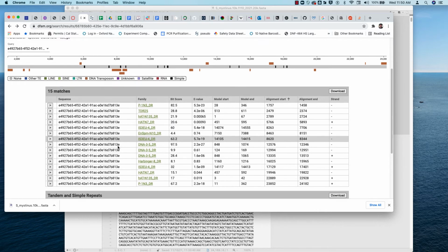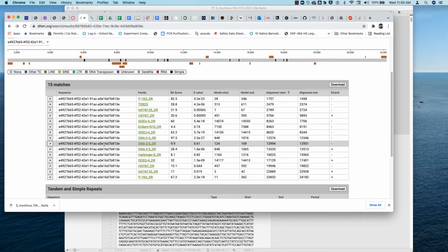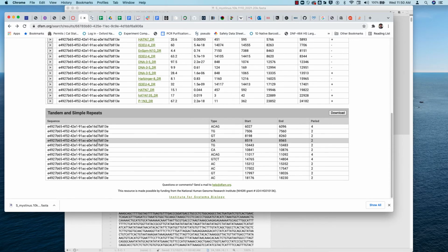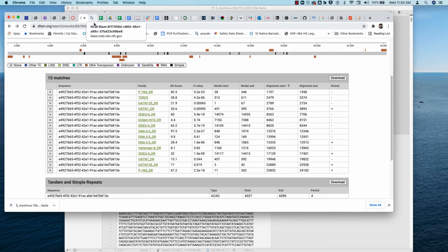So what you're going to do is take these results and the results from any blast results and put them onto a table that you'll be analyzing and using for your paper. You can ignore the simple random repeat information on this page, by the way. It's not necessary to look at, but it is indicated here in these black regions.